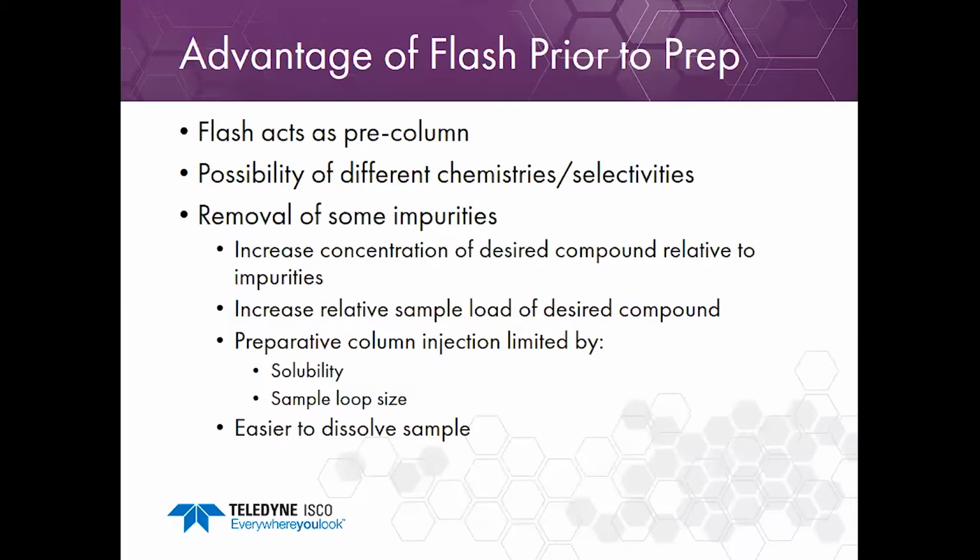The sample loop size as well. You can dissolve your sample in a weaker solvent, and that is better, but if you only have a 5 ml loop, that limits you to fairly small injections. By removing the nonpolar impurities, it just becomes easier to dissolve the sample.